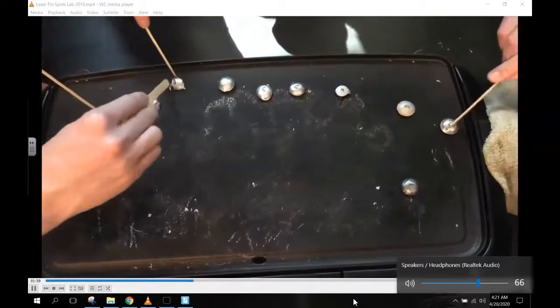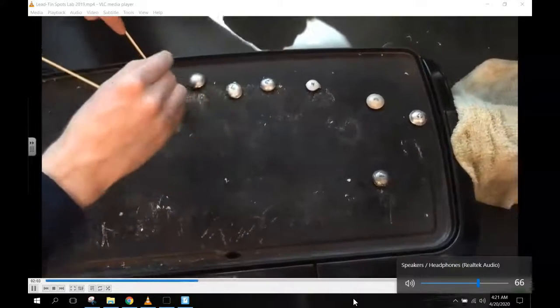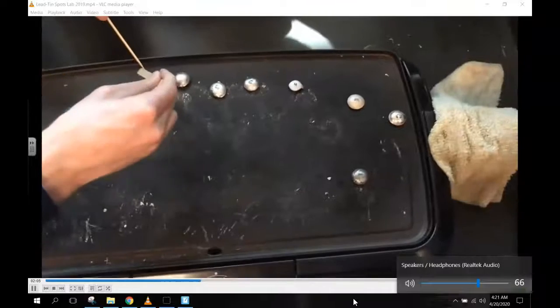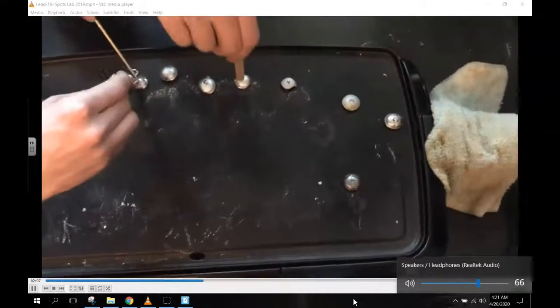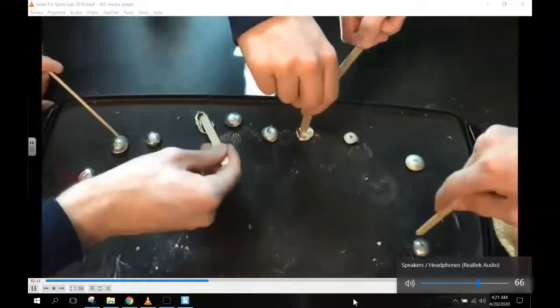We got one melt. Oh my god. Wait, what? Let me see. Number 8. Number 8 melted first? Yeah. Holy cow. Is that supposed to happen? Oh my god, it's because it's an alloy. Oh my lord. That one's melting too. Dude, it was six.